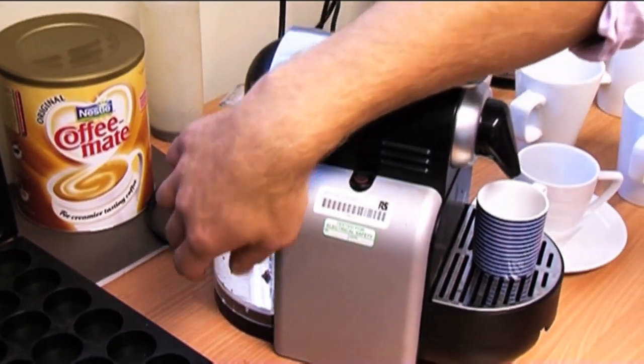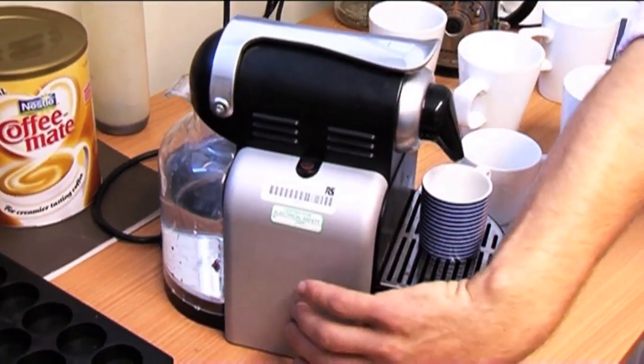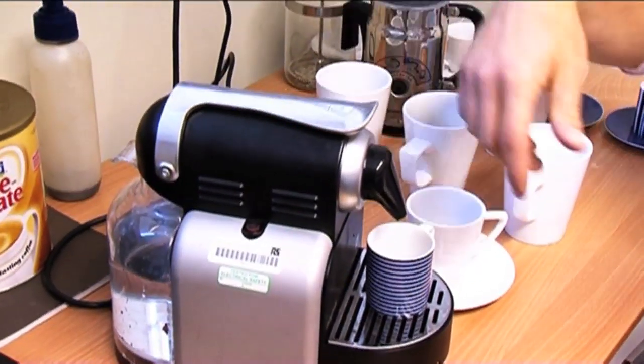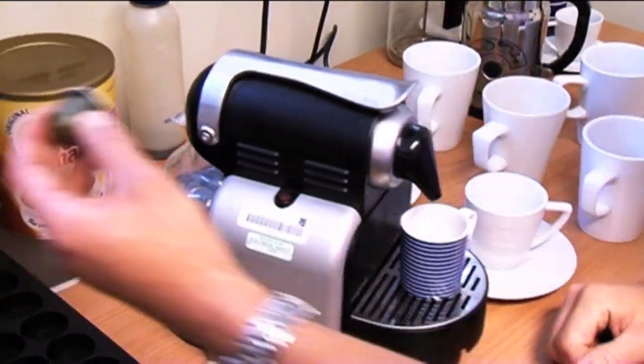Because it's working at high pressures, we think it's got the potential to run at higher than boiling temperatures as well. And that's what you need to make these nanoparticle systems. Right at the back here, we've just got a pot of water and it will take water through a high pressure pump and then heat it up, push it through these coffee pods here.